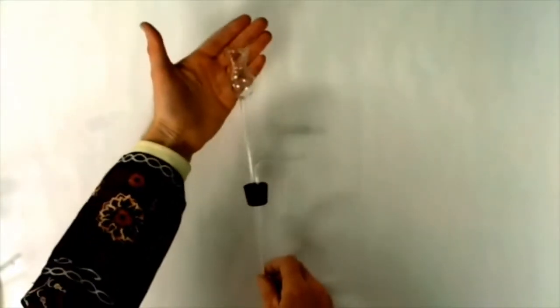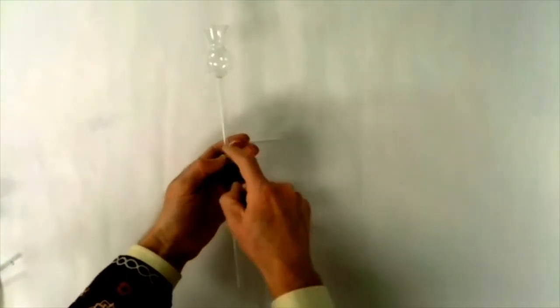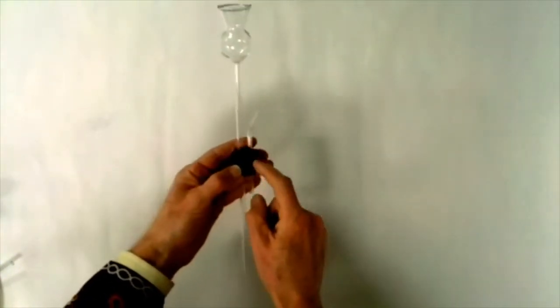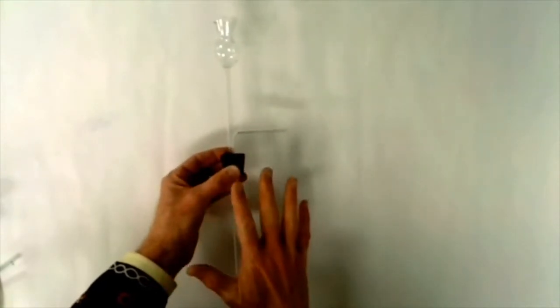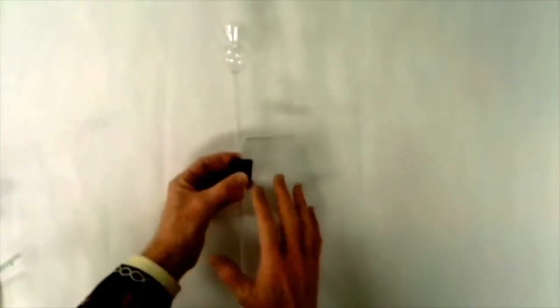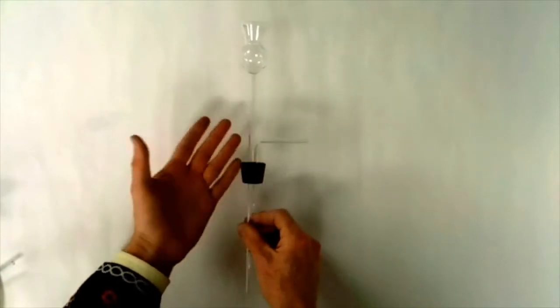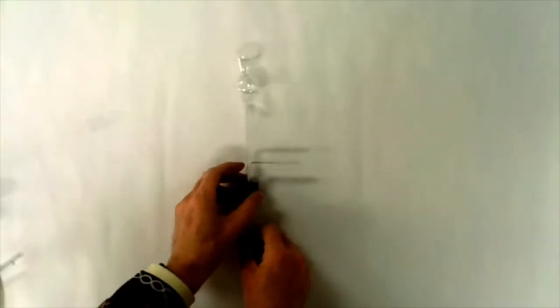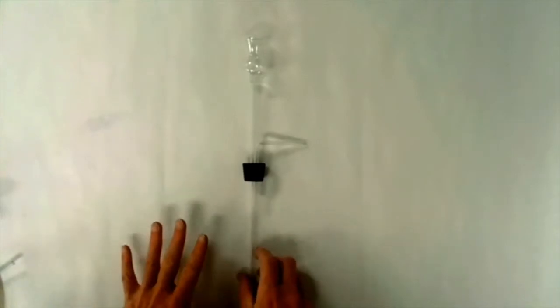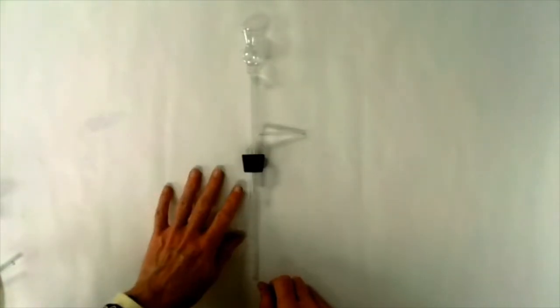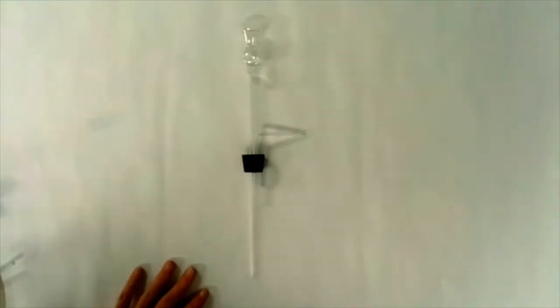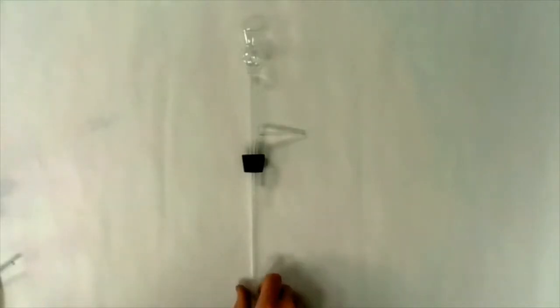This is the glassware you need. The first thing is this thistle funnel and a 90-degree bend, both through a rubber stopper. This assembly will get already assembled. Don't try to change it in any way. Don't try to move the tubing or anything like that. Trying to change where the tubing is in the stopper is a really good way to stab yourself with broken glass. We don't want that.